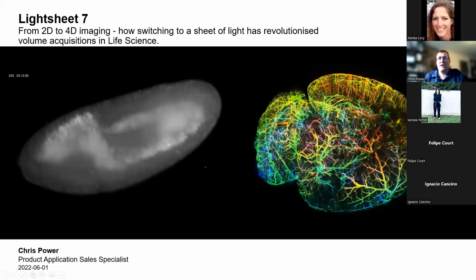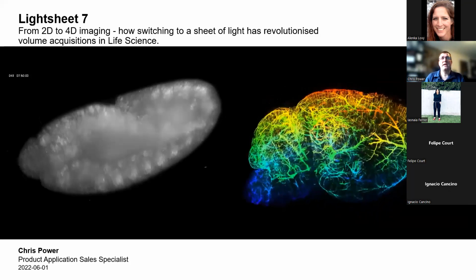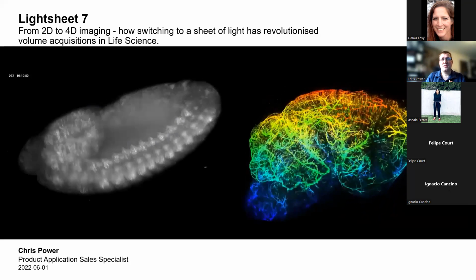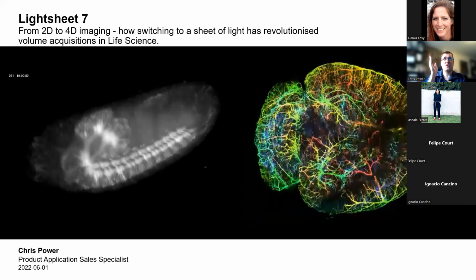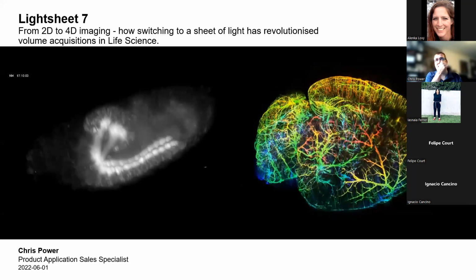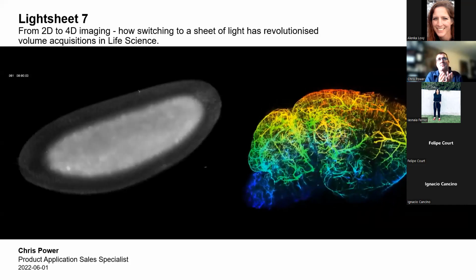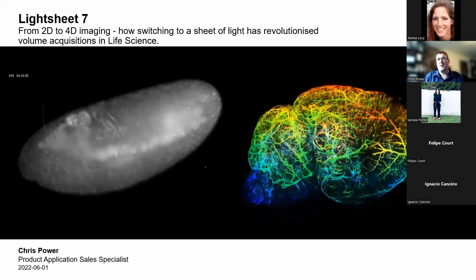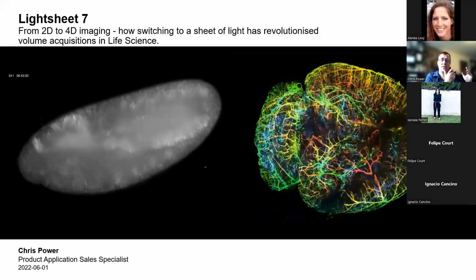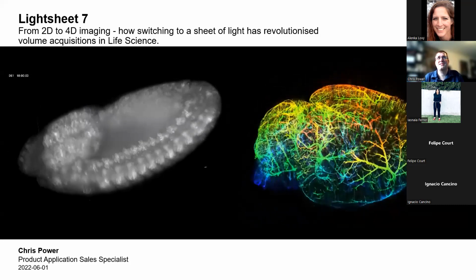But yeah, what I'm going to cover initially is how light sheet came to be, how we started this as a machine for looking at live samples, such as the image on the left here. This was one of the first images taken from the prototypes, and how that system changed from being just a live cell system into a clearing system. I know there's some repetition with some of the course that was also given about 6 months ago, but yeah, hopefully it's still useful.